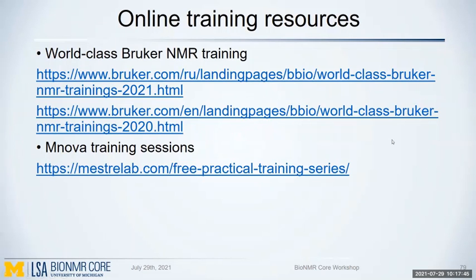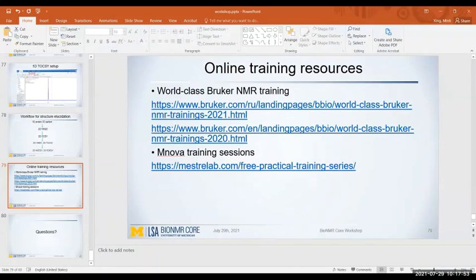So we still have some time, so I will go ahead and show you how to process data using MNOVA. So first, to start my MNOVA software. I think most of you have downloaded MNOVA and you have the license available. If not, let me know. I will send you the link for the license. MNOVA is a very powerful tool for small molecule characterization, and with that software, you can do almost all those analyses and processing.